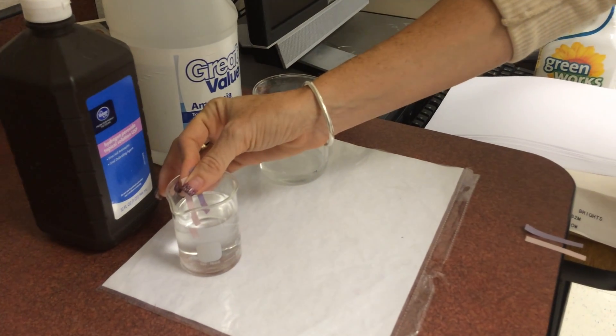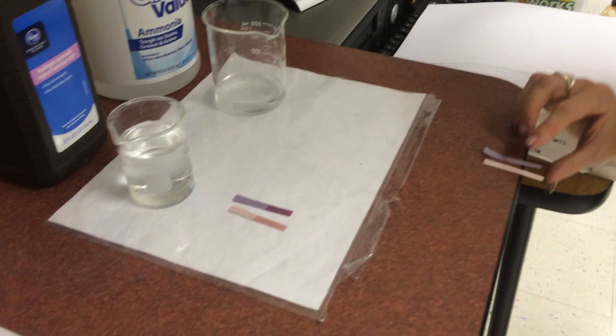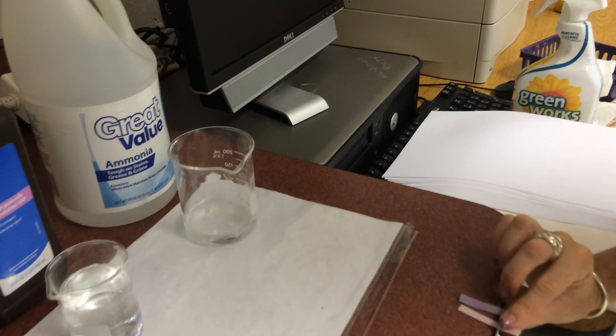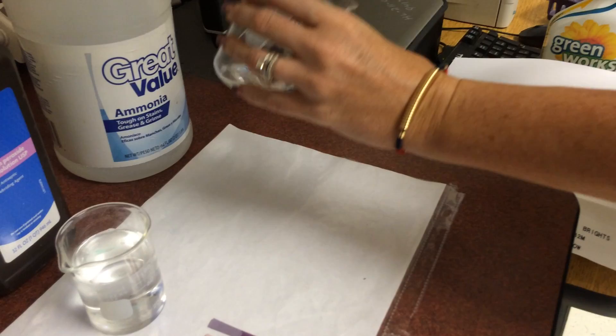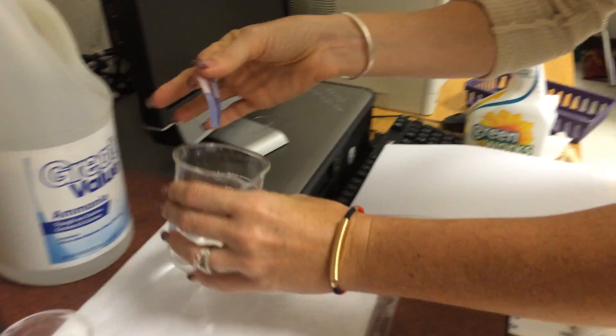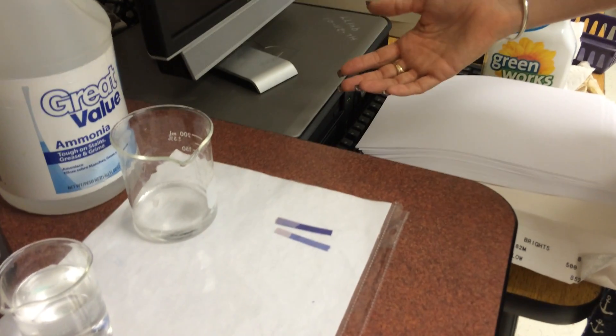Hydrogen peroxide: we got red and blue, so we're definitely neutral. And last but not least, ammonia - the stinky one, save the best for last. Blue plus blue equals base.